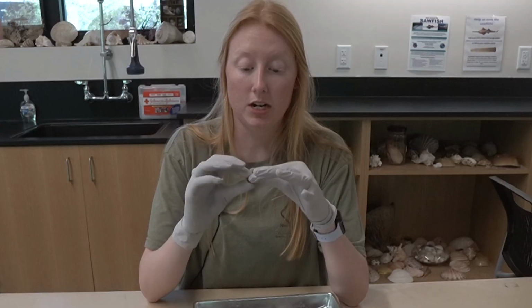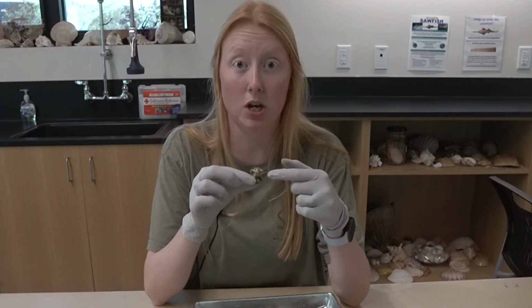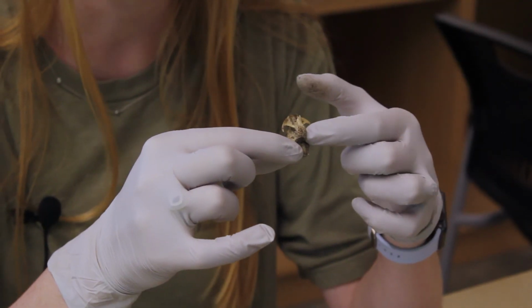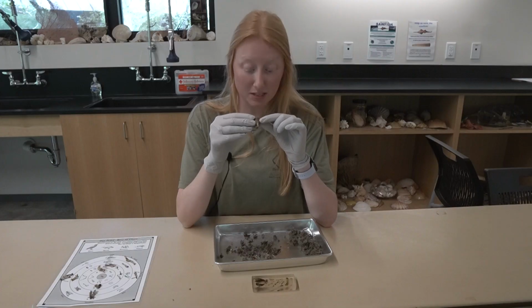And if I turn it this way, you can see the top teeth of the rodent. We saw the bottom teeth that were connected to the bottom jaw. That bottom jaw comes off in two different parts. And then here are the other two rows of top teeth. This is a decently clean rodent skull found in an owl pellet. That is the majority of the pellet.